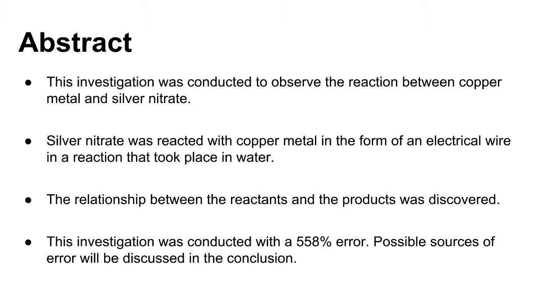This investigation was conducted to observe the reaction between copper metal and silver nitrate. Copper metal in the form of electrical wire was reacted with silver nitrate in a reaction that took place in water. The reaction took place over the course of approximately 30 minutes.